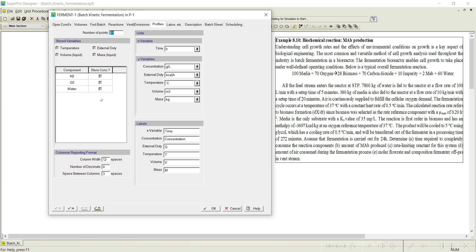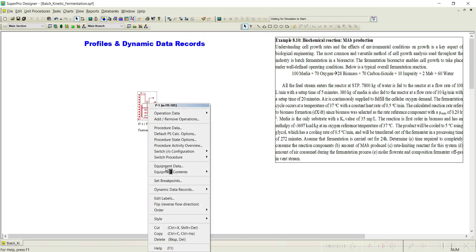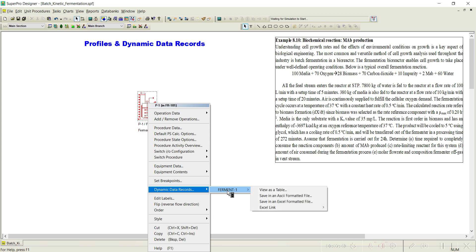Basically, a profile will help us understand the rate of concentration data versus time. That is nothing but differentials — if it is biomass you write dx/dt, if it is product dp/dt, or if it is substrate ds/dt. So with respect to time, you get how these particular constituents or chemicals — like biomass generated or chemicals consumed — change in the process. To access the dynamic data records, just right-click on any equipment and you will see dynamic data records. Go to the fermenter and you can understand how the components in the system are changing with respect to time.